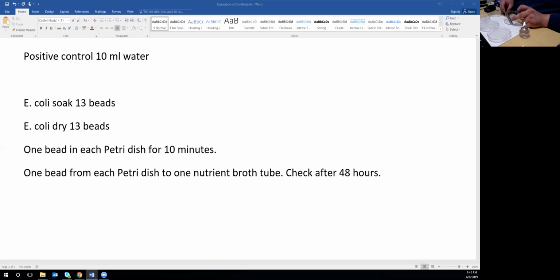because the alcohol is what kills the bacteria. And now I'm going to pass this over the fire like this. See how it catches on fire? We want that to happen because when it catches on fire, it burns away the alcohol, and now this is not only clean, it's also absent of alcohol.